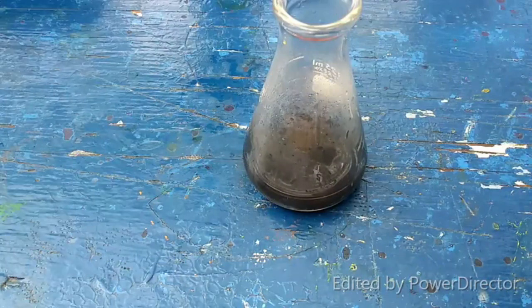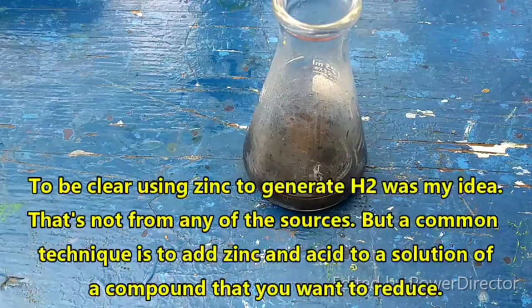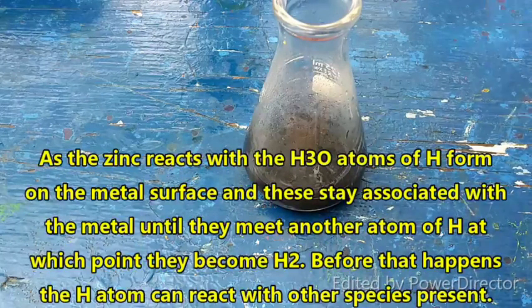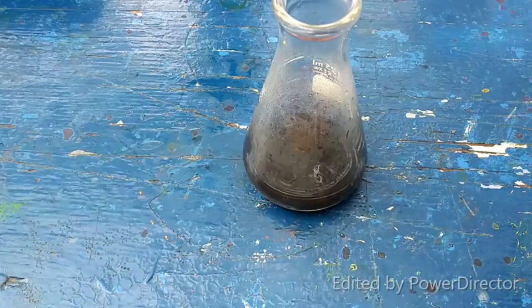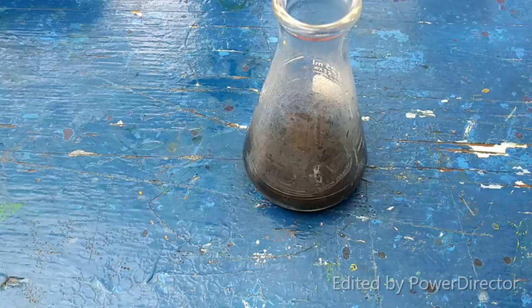Now, maybe I misunderstood. Maybe they meant that this source is so old, they still talk about nascent hydrogen. Which is just funny. Nascent hydrogen is just atomic hydrogen, like you get if you get hydrogen generating on the surface of zinc. So maybe that's what they meant by hydrogen gas, in which case you'd have to add zinc and acid to it in order to make that work. Just like I had to add sodium borohydride into this. So, yeah, it needs to be a source of atomic hydrogen. So, anywho, there you go. So anyway, let's move on to the next compound.